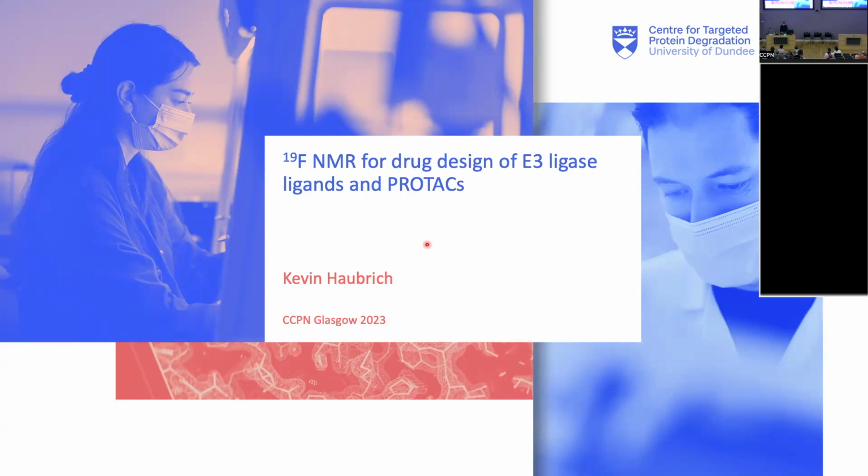So I've got the pleasure of introducing you to some of the ways we use 19F NMR for drug design of E3 ligases and targeted protein degradation. I'm going to use the words targeted protein degradation and PROTACs a lot, so I'm going to spend one slide on actually introducing these concepts.